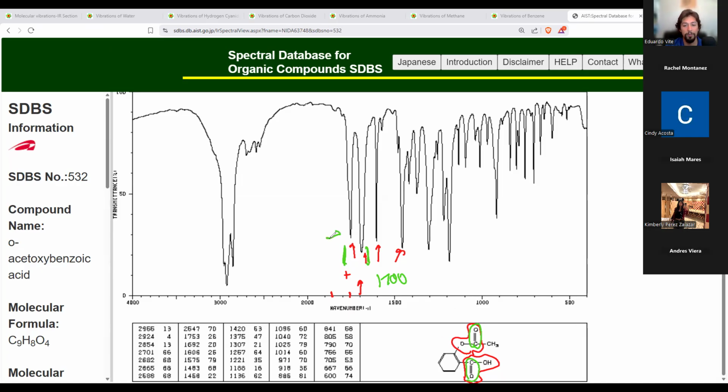So one of these carbonyls, and then this one here is also a carbonyl. And I can say that we have two carbonyl peaks because the structure has two carbonyl peaks, you see? So now I can make these claims. Now I can actually say both of these are behaving as predicted, and the structure reflects that both of these are the signals.